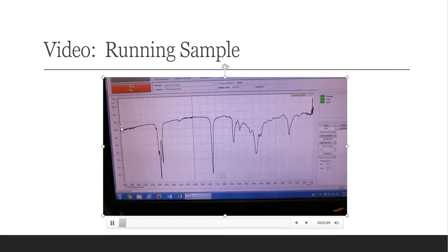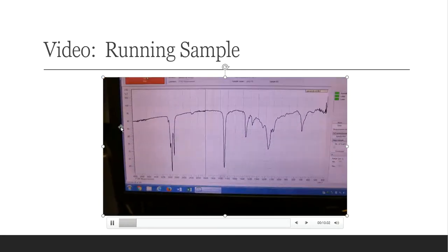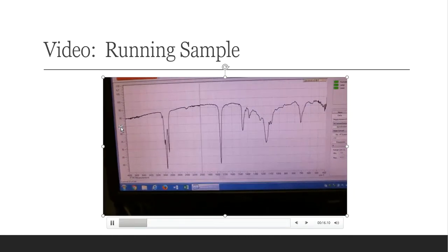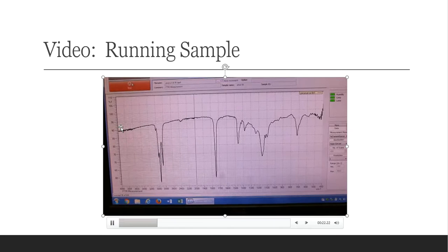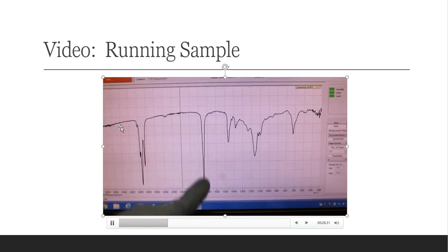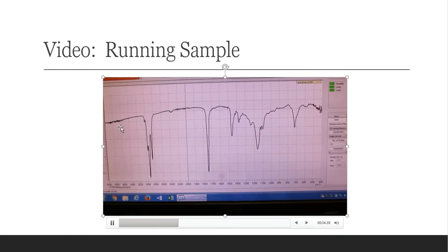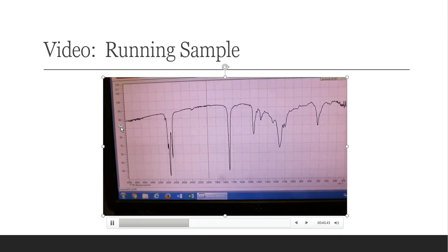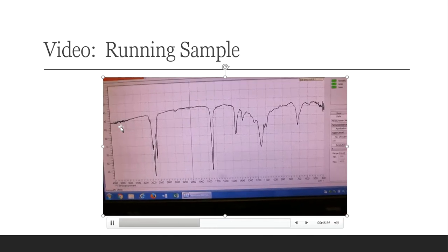Okay, so as with the directions last time with the FTIR, you know how to use it, you know how to run it. So I'm running my peanut oil. That is what you're seeing on the screen right now. A couple of things that I will say, it looks very good to me. The peanut oil is not going to evaporate on me throughout the run, so I don't have to worry about putting more on the FTIR attachment as I'm running it. But a few of these lines are very traditional with an oil or something that is mainly hydrocarbon-based with a few ester groups. Again, you'll know this in another class in the program. Don't worry about it yet. But after this runs, I'm going to database search it, and I'm going to cross-reference it to see if it does give me an oil.